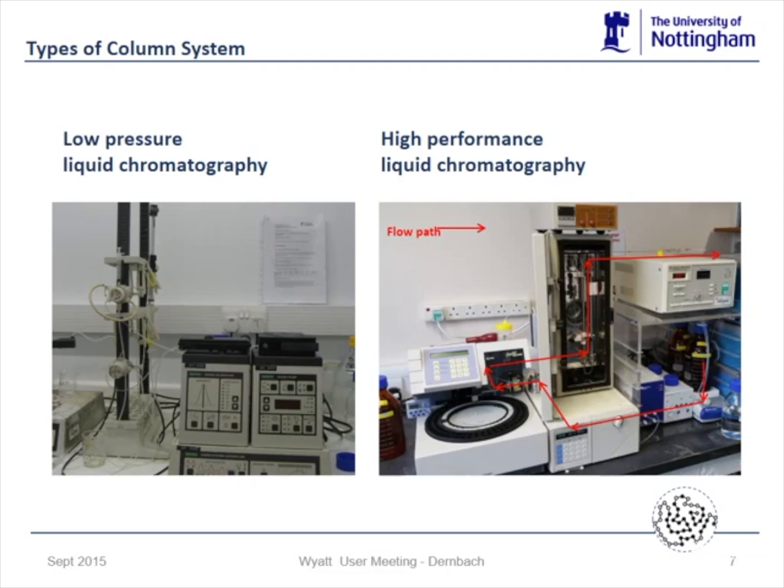And because of the nature of chromatography, we probably need 2 analytical columns in order to cope with quite a wide range of molecular weights. So one of these columns would be for high molecular weight, one would be for lower molecular weight, and you can put them in together in series, and you can make it a broad range technique.